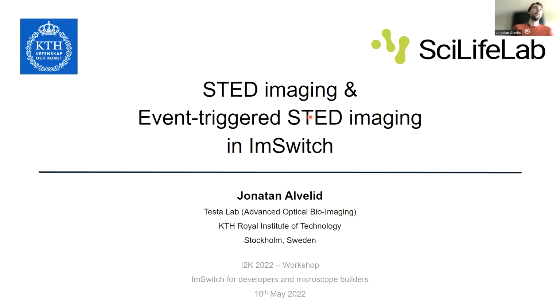In the end, I will also briefly mention event-triggered STED imaging, which is an acquisition method I've been developing that was really enabled and benefited a lot from the architecture of ImSwitch.